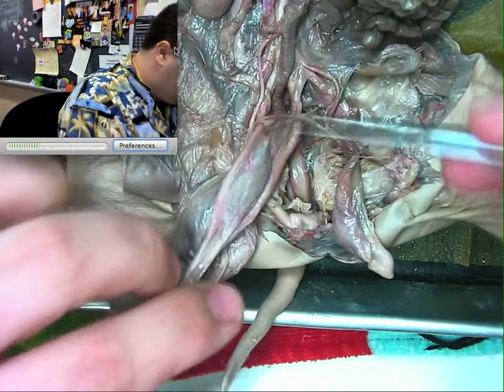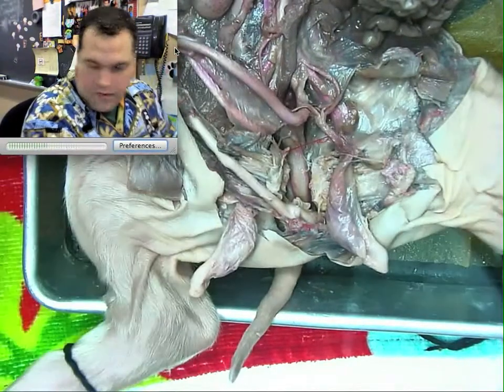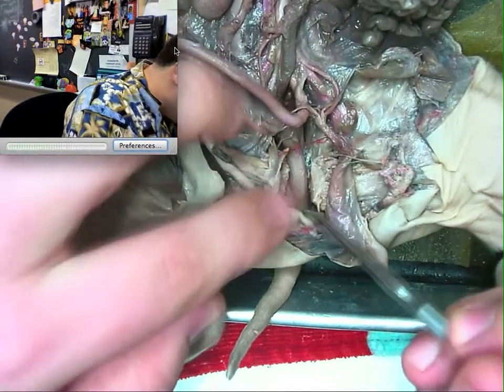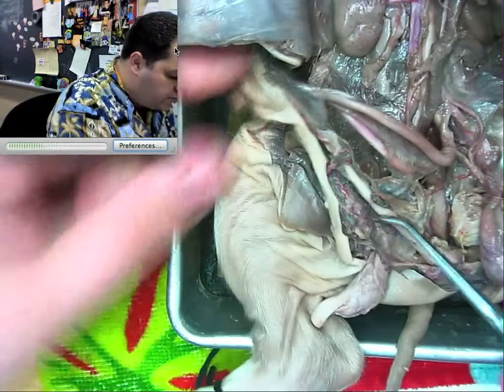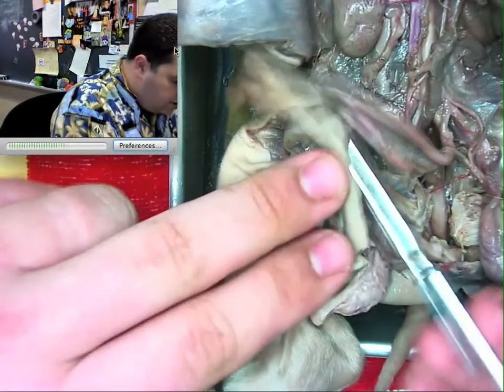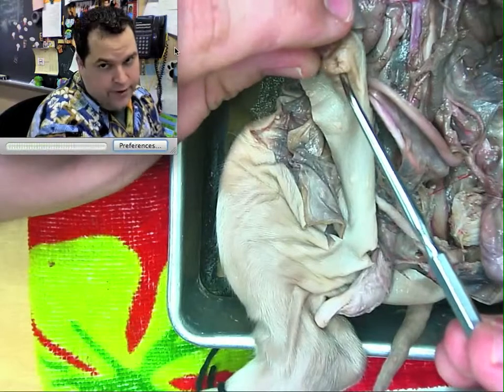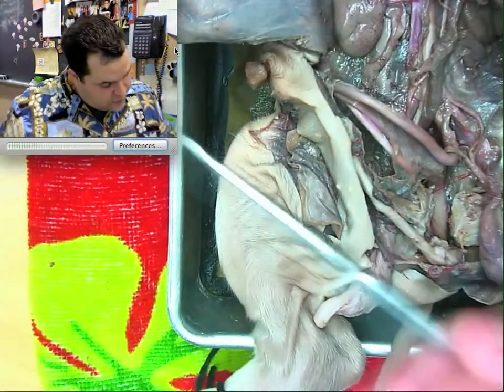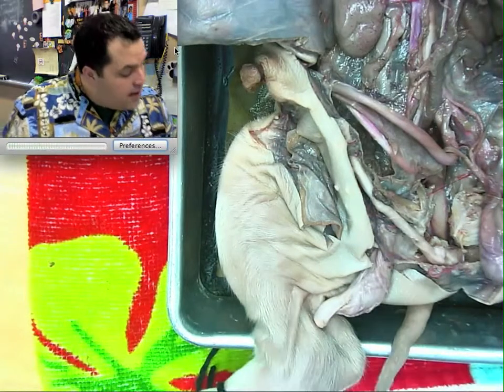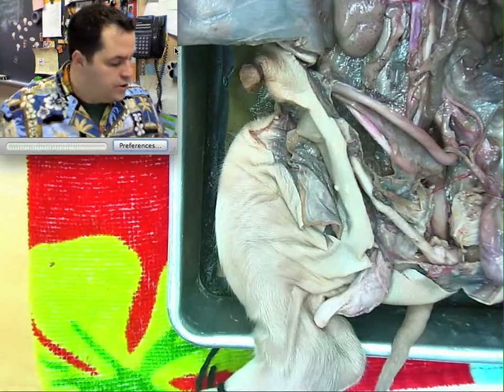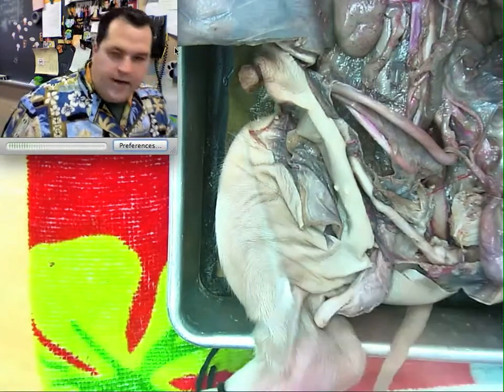The seminal vesicles are located here — that's where the fluid medium of semen will be added, making it semen proper. The urethra continues and we reach the prostate gland, then we go into this large white structure, which is actually the penis. The penis runs very ventral to the umbilical peninsula, and if we follow it all the way up, it ends at this opening, which we identified as the urogenital opening. During sexual reproduction, the penis would emerge from the urogenital opening. This is also where urine would emerge, though the penis does not emerge during urination.